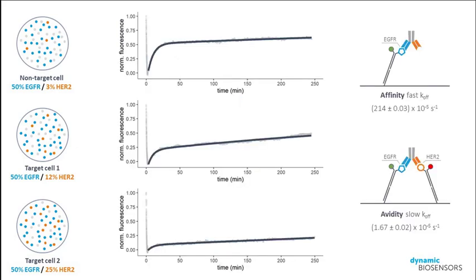Now, after creating these functional surfaces, we ran the same kinetics assay. So we took our bispecific construct and ran the same assay on all of these different surfaces and wanted to compare what the binding profiles look like, so what the dissociation profiles for the same bispecific antibody looked like. Again, here I repeat, we were looking at the green fluorophore in this case. So we were assaying the enhanced binding to EGFR when a higher percentage of HER2 was also functionalized onto the surface. And what you can clearly see when we go from the top dissociation profile that had the lowest percentage of HER2 all the way down to the highest percentage of HER2, is a flattening of the profile. A flattening of the profile corresponds to an increase in the surface residence time, or the binding half-time that Stephanie had nicely illustrated earlier.